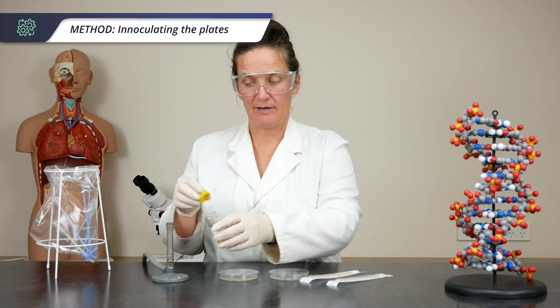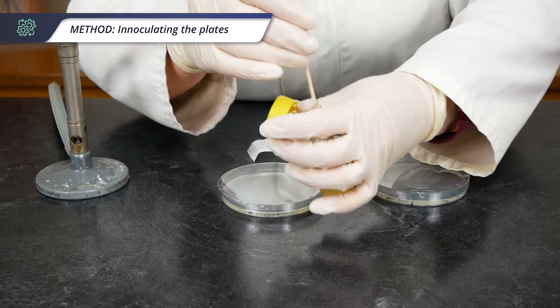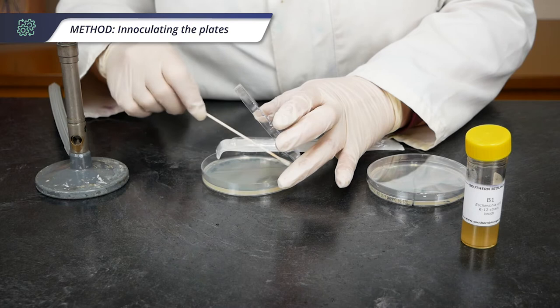Take your bacteria, pass it through the Bunsen burner flame, open your swab, dip it into the culture, and get it nice and wet. Remember to put the lid on once you've finished with it to stop any contamination. Open the lid of the petri dish again towards the flame and rub it as evenly as you can across the agar plate.